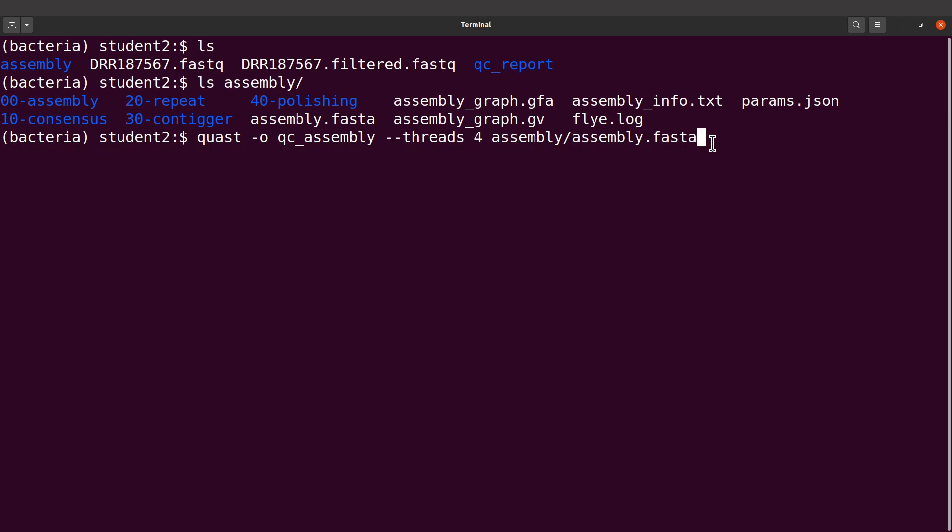If you also have a challenge with running QUAST, you can always let me know and we can have a session together. Let's execute this command.